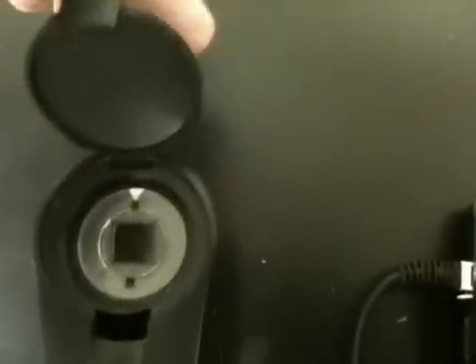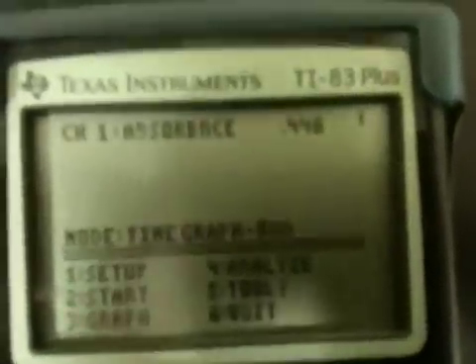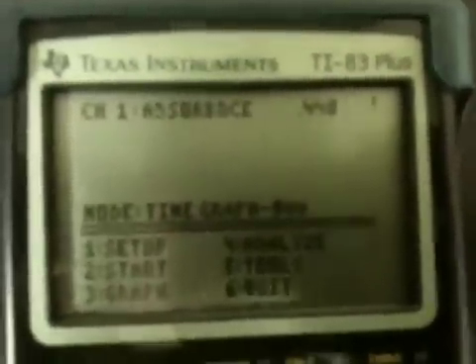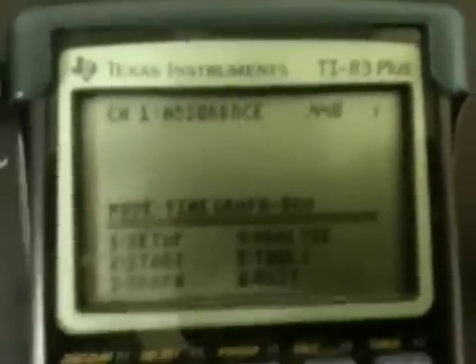Now that it's calibrated, we want to leave it calibrated and leave the calculator on, and we can now start measuring all of our different samples. I'm going to put the blue solution in, making sure the cuvette's facing the right direction. And then I should see the absorbance automatically change — and I do. I have my absorbance reading, and in your lab notebook you would record 0.448. If you guys have any other questions, please let me know. Thank you.